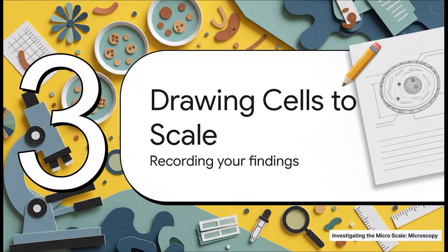You've found your cells, you've got them in focus, now what? You need to record what you see. And in biology, that means doing a proper scientific drawing.